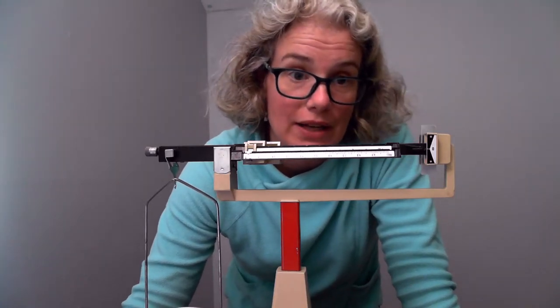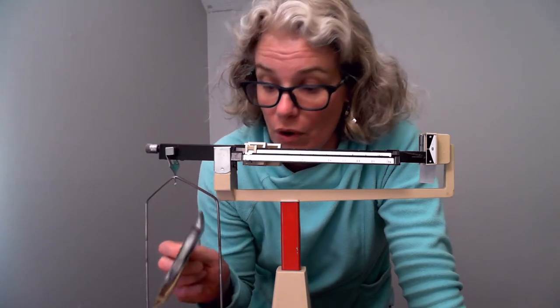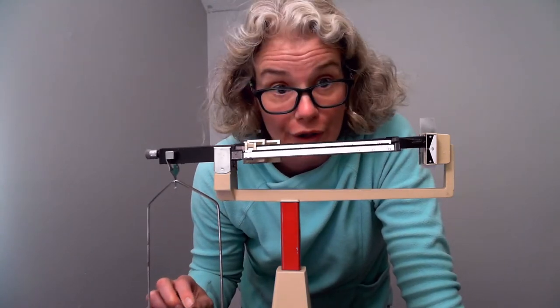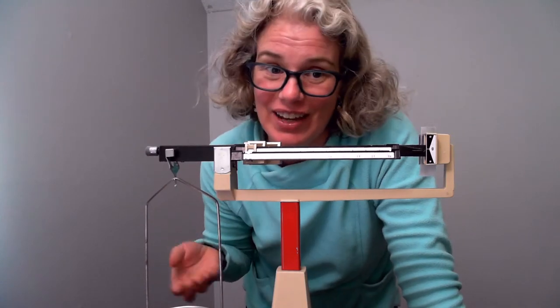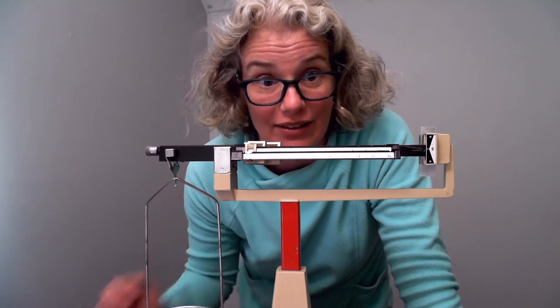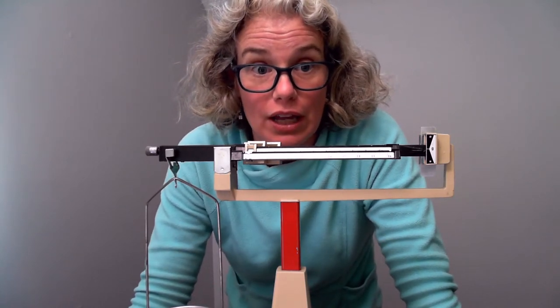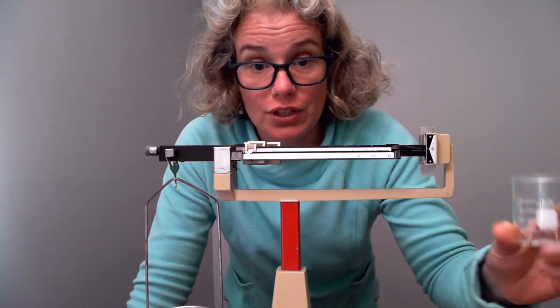Today we're going to talk about how to find the mass of something you don't want to put directly onto a contaminated scale, or the mass of water that you can't pour onto the scale and then transfer without losing some. If you want to be accurate, you'll have to use a container.